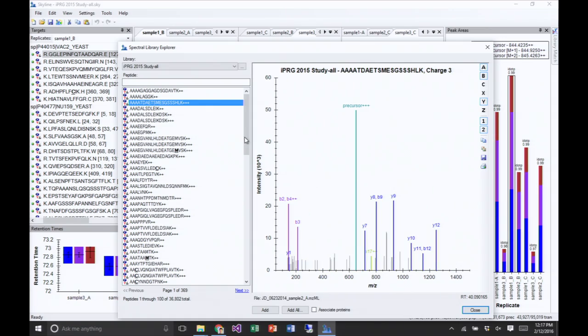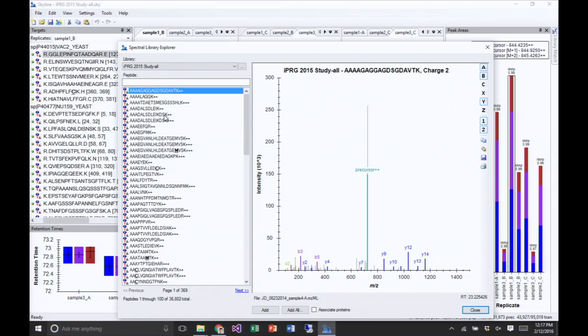So what we're really here to look at is down here. It tells us what file this spectrum was from, and it tells us the retention time this spectrum was from. So if we have any problems with IDs, like they don't show up, or we just got a message on the support board that somebody gave us a new format that we imported to make a spectral library, and all the retention times showed up half where they were supposed to be. So a retention time that was supposed to be at 32 would show up at 16, and that was just a bug in parsing the new format that the retention times were showing up in.